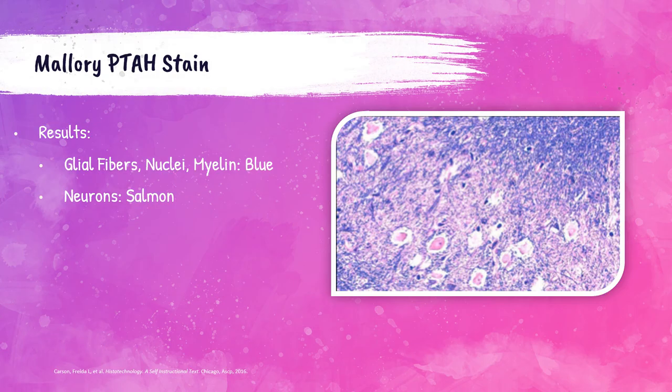When stained with Mallory PTAH, glial fibers, nuclei, and myelin will be blue; neurons will be salmon (pinkish). The photo shows glial fibers and myelin in blue and neuron cell bodies in salmon pink. Note there is a lack of intensity with this stain, and because both glial fibers and myelin stain blue, interpretation can be difficult.